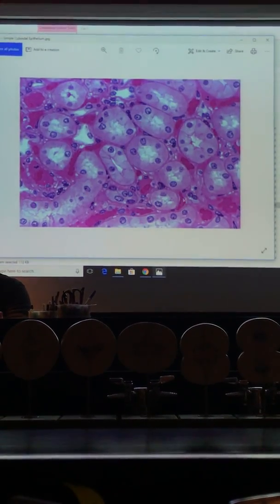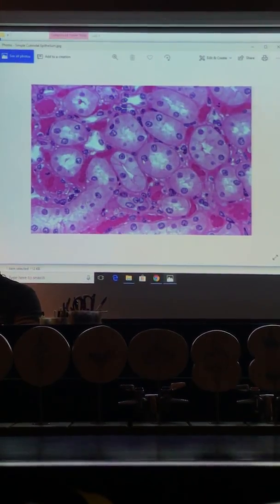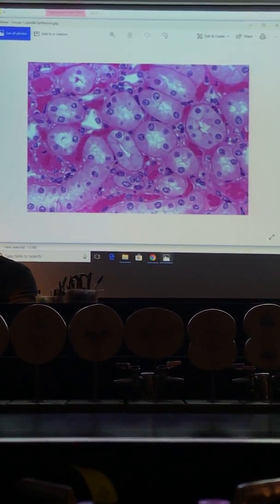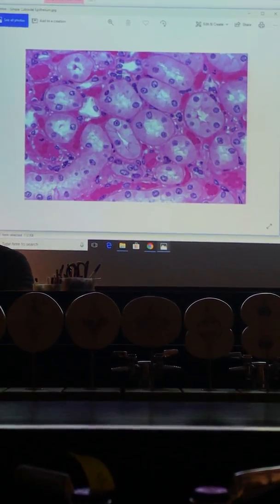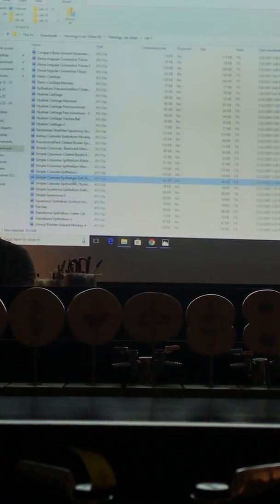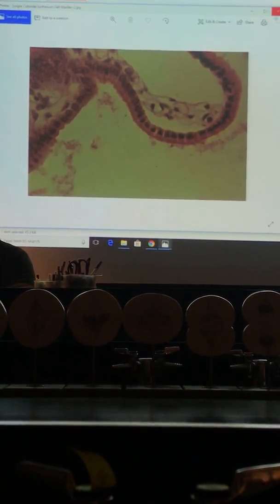This is a gorgeous image of your kidney slide, slide 69 or 70. And I would say identify this tissue specifically. And the answer is simple cuboidal epithelium. Somebody say, well, why isn't it stratified? Because there's more than one layer, because these are tubes cut in cross section. Okay? So simple cuboidal epithelium. I don't see the squamous epithelium there. It's another example of simple cuboidal epithelium. Yes, these can be on the exam. No, they won't be labeled. But I've done that before. I've left labels.